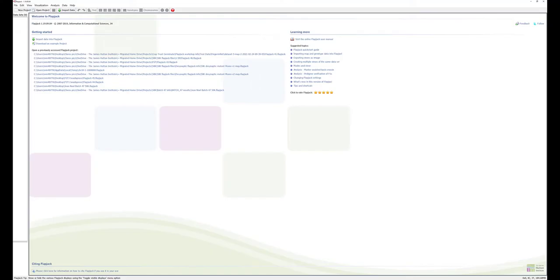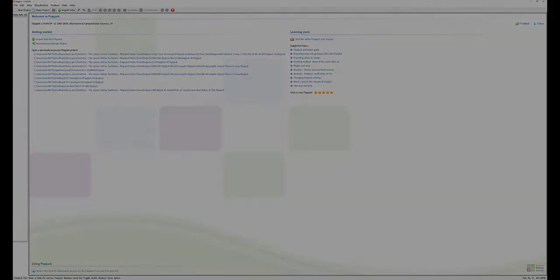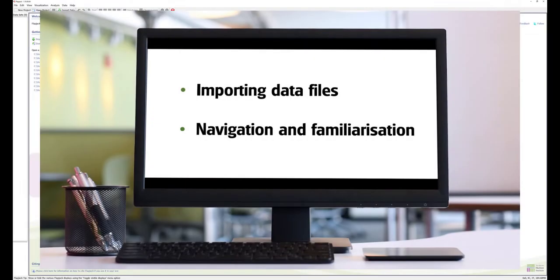Hello and welcome to this Flapjack tutorial where we will cover the following topics: importing data files, navigating and familiarizing ourselves with the interface.